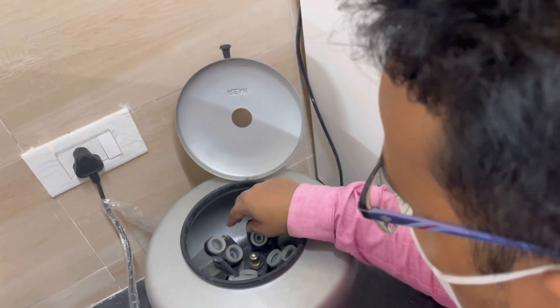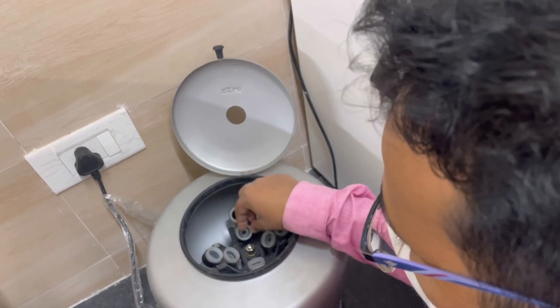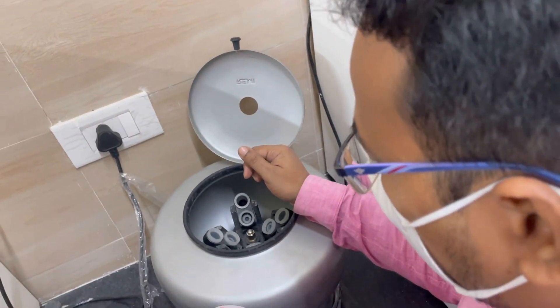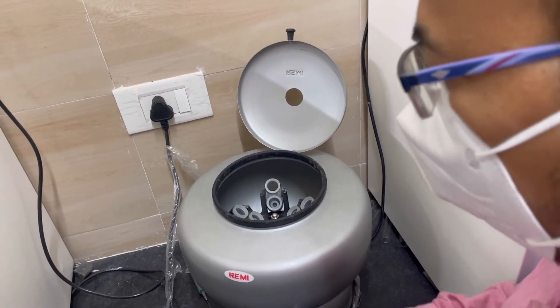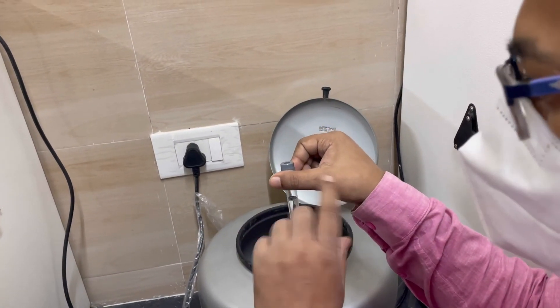The balance is very important when loading the centrifuge. Without proper balancing, the centrifuge will no longer balance correctly. The balance must always be maintained. You can separate the blank amount to 2 ml.